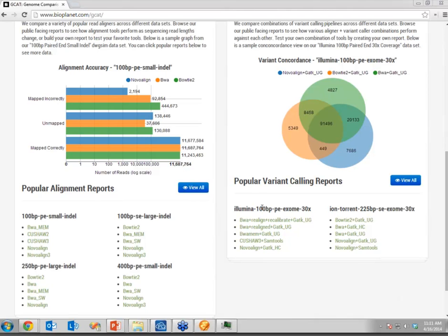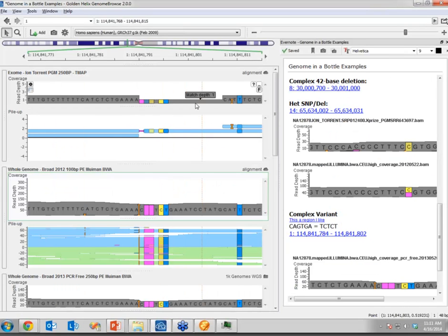The closest thing I've seen, and I touched on this in my own exome analysis webcast, where I did an analysis of my wife's data because I was interested in her HLA region, given she has a phenotype related to the immune system, was that you can use a specialized process to essentially align against all the known HLA alleles and then rank those based on which ones have the best alignment statistics and coverage. And that's actually what Omixon does with their HLA target alignment, and they'll take exome data and run it through a completely different algorithm. You won't be able to look at it right there in your BAM pileup with all your other data because it's essentially aligning against the 300 known HLA types or whatever, and then you'll just get a spreadsheet with which HLA genotype or haplotype or which HLA type you're likely to have. So that's really the appropriate way to go about it.